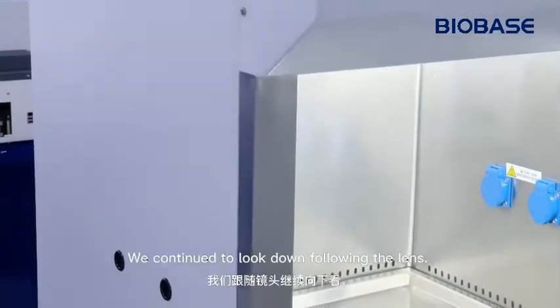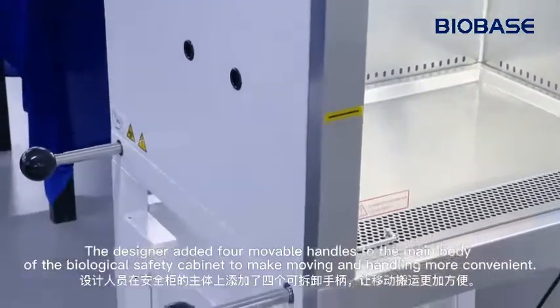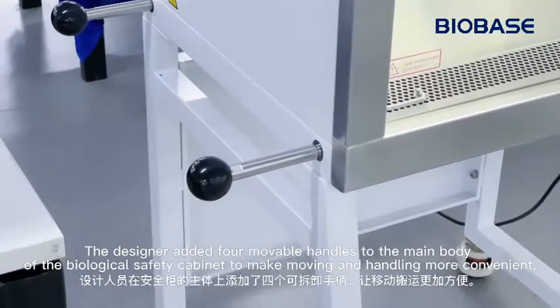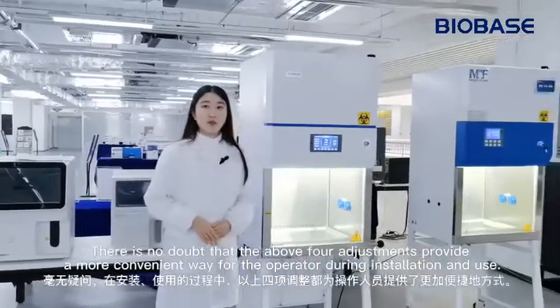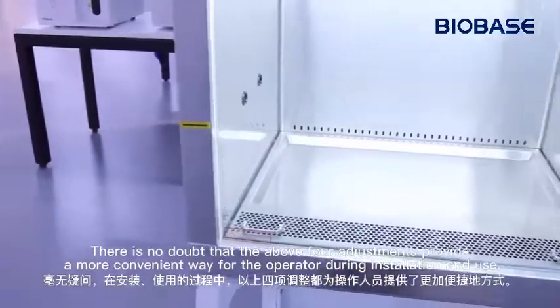Continuing to look down along the length, movable handles have been added to the main body of the biological safety cabinet to make moving and handling more convenient. There is no doubt that these adjustments provide a more convenient way for the operator during installation and use.